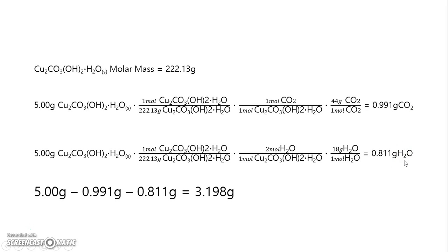Now, once we subtract these two values from our original 5 grams, we get 3.198 grams, which should be the mass of the leftover copper oxide.